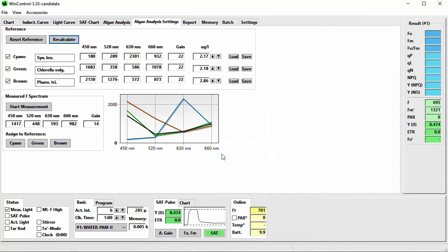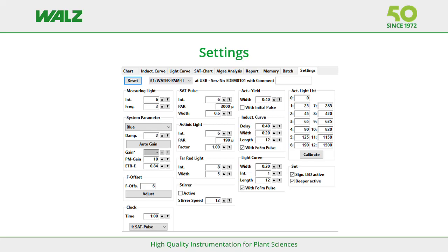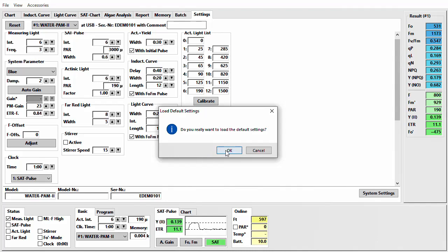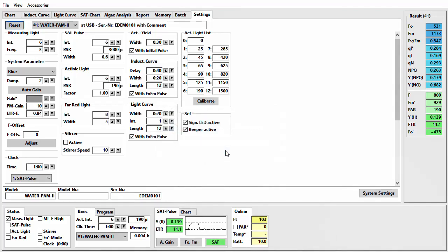Recalculation of the algae composition can only be done with the WaterPump 2 instrument connected. Before I come to the Report and Memory tab and data management and export functions, I will talk about some more settings relevant for your experiments. As the name suggests, the Settings tab allows you to define the settings for your instrument. Settings can be set to default values by pressing Reset. If you close the program, settings will be stored and reopened in the same configuration when you work with WinControl 3 again. The Settings tab is divided into many fields, each with a heading to clearly assign the contained settings.